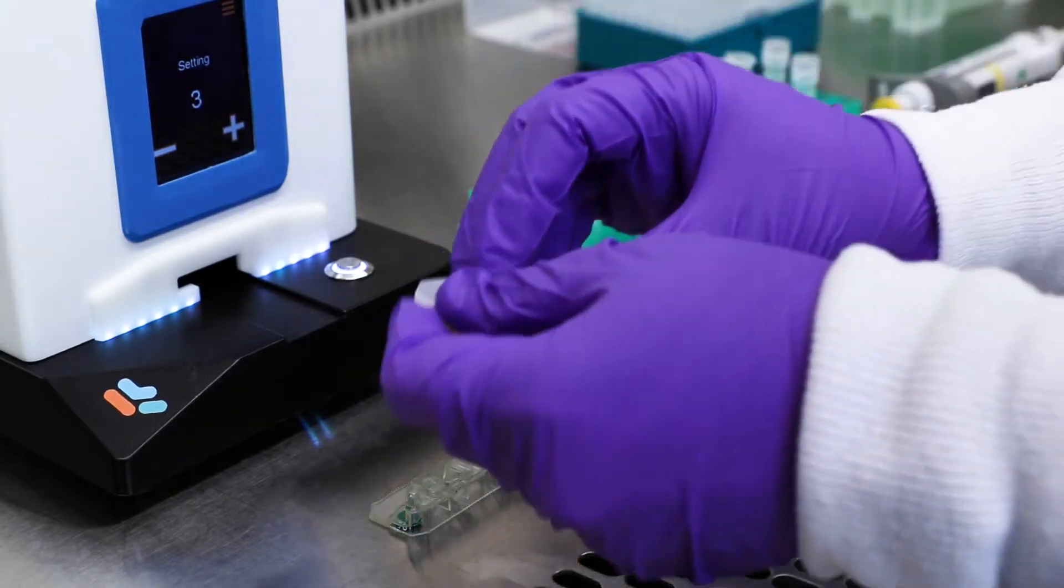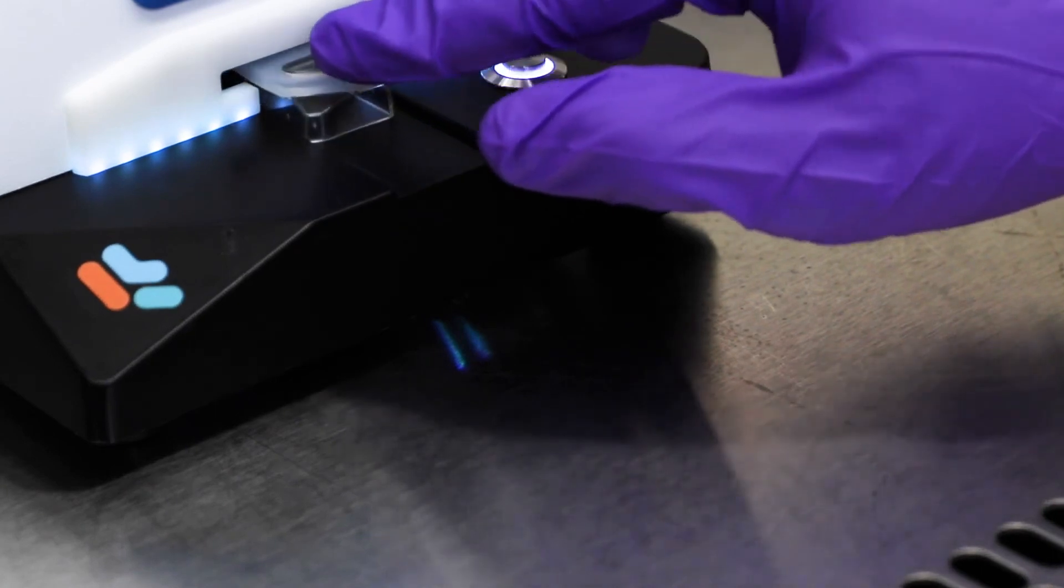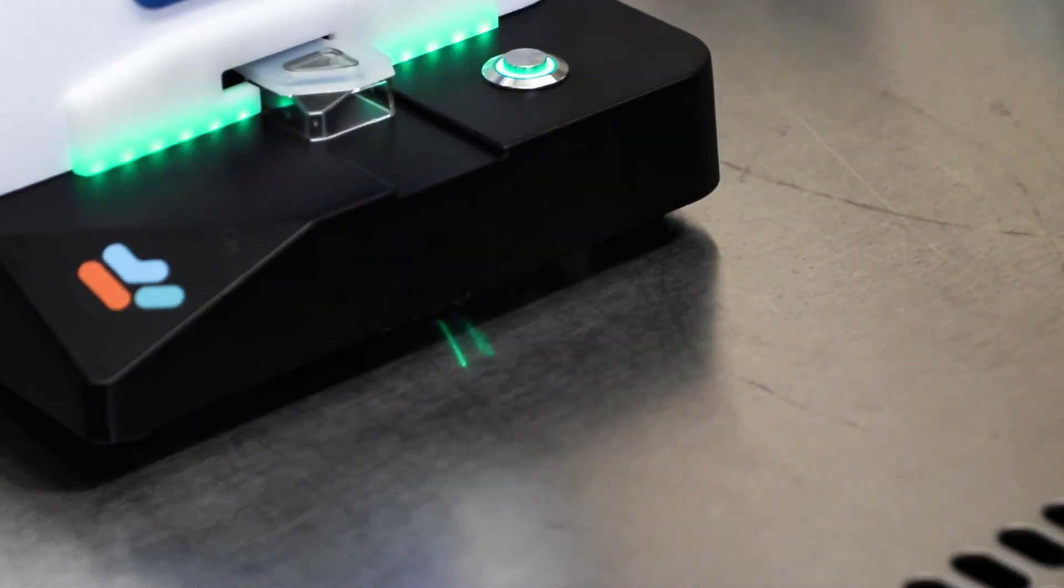Securely place the cap over the Spark cartridge and insert the capped cartridge into the Spark as shown. The status light will illuminate green when successfully inserted.